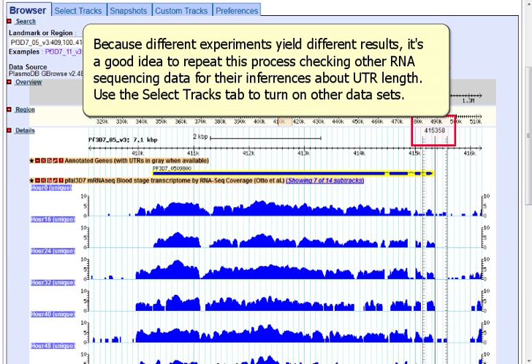Because different experiments yield different results, it's a good idea to repeat this process checking other RNA sequencing data for their inferences about UTR length. Use the Select Tracks tab to turn on other data sets.